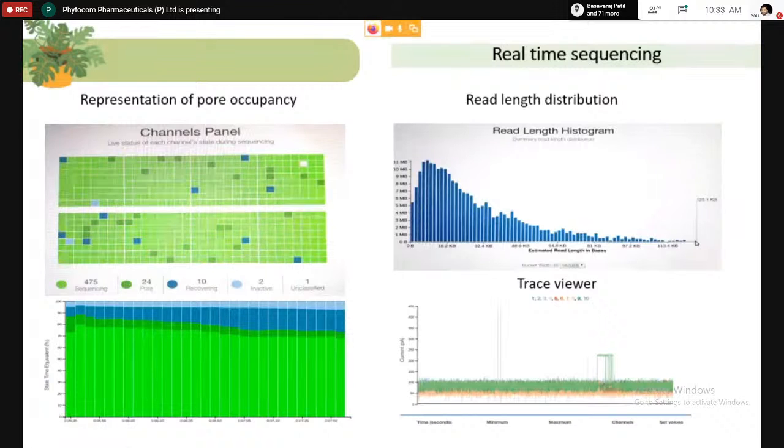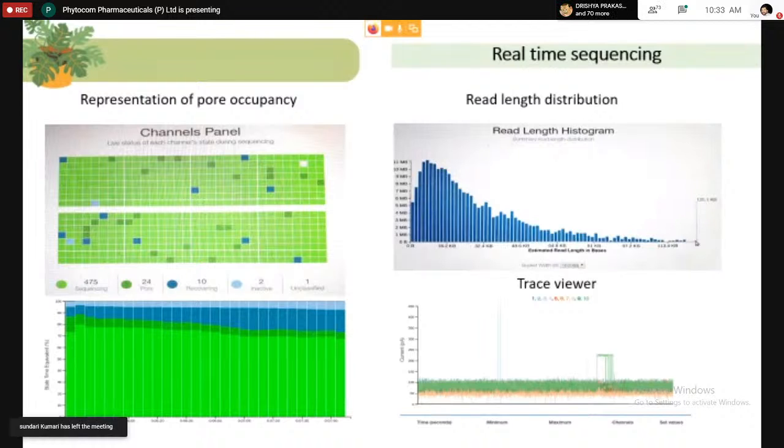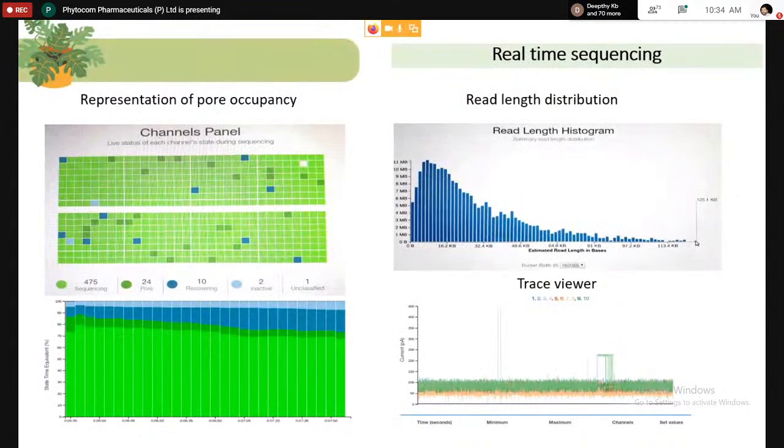You see whether you are getting any DNA from the previous load. Based on how much DNA you get from the previous load, you can use the same barcodes or different ones. It is always advisable that if you used barcodes 1 to 12 for the first run, the second time you use barcodes 13 to 24. And you can see the sequence length obtained. Around 11 MB sequence has also been obtained in published data. So these are the parameters for checking the efficiency of the pores when sequencing.